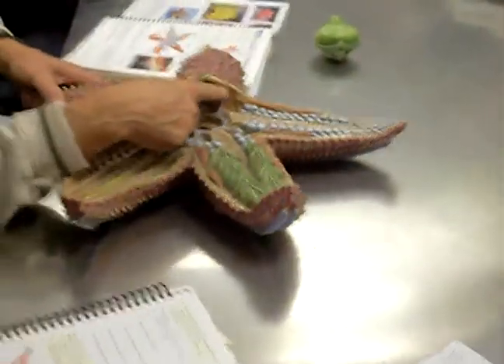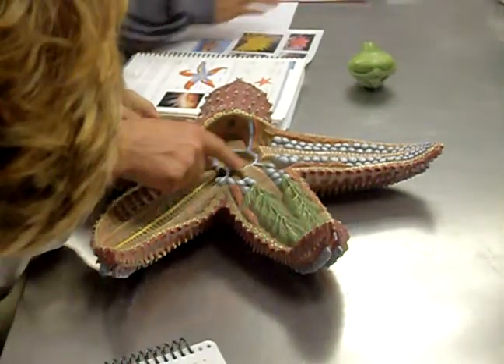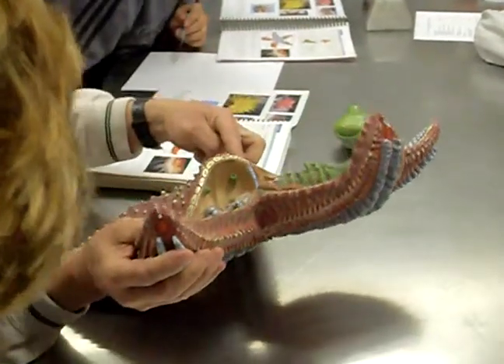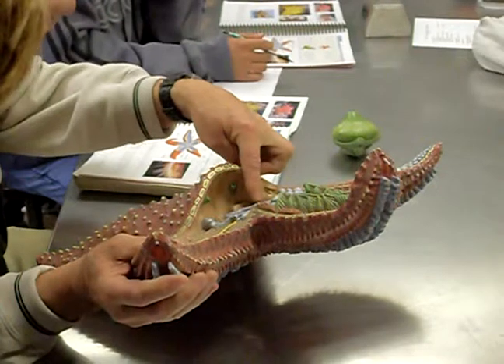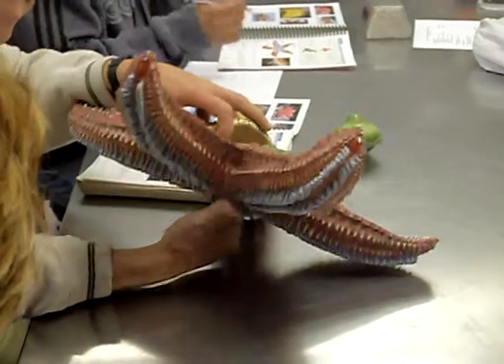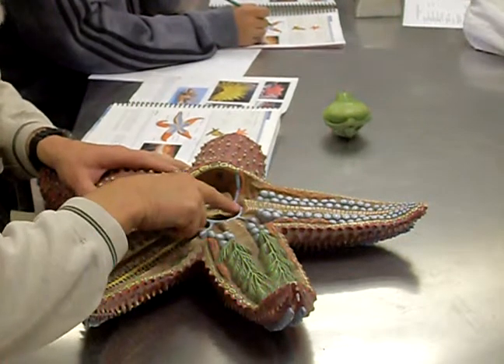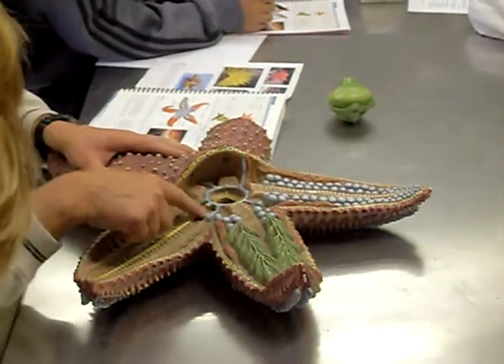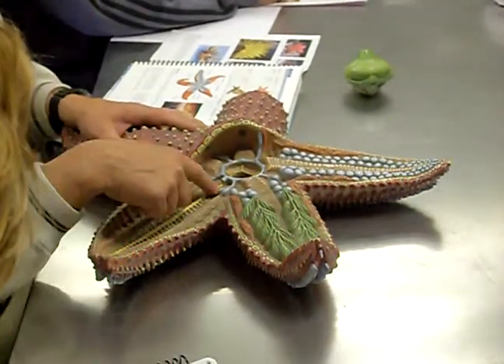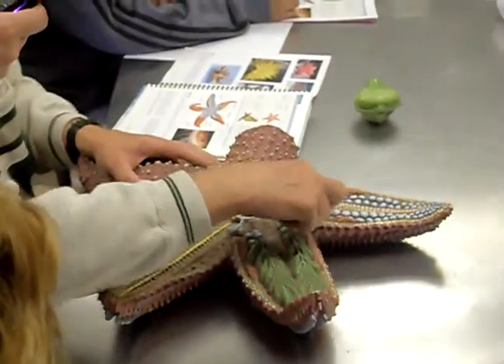From the madreporite it connects to what's called the stone canal, which is labeled on this figure, and that goes down to the ring canal. So the water goes in through the sieve, down the stone canal, and then enters into the ring canal, which is around the mouth. Then it radiates out into each of the arms via the radial canal, which runs underneath — it's been cut off here to expose the nerves underneath — running out the length of the body all the way to the tip.